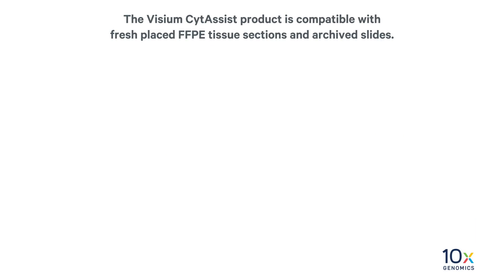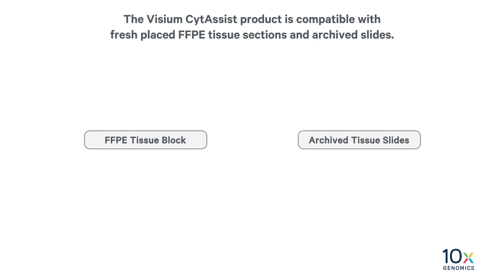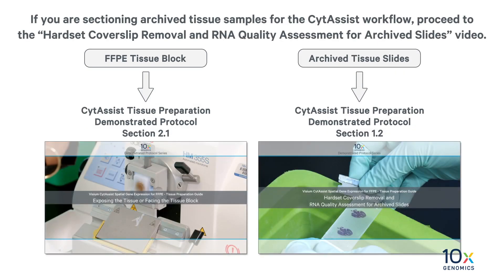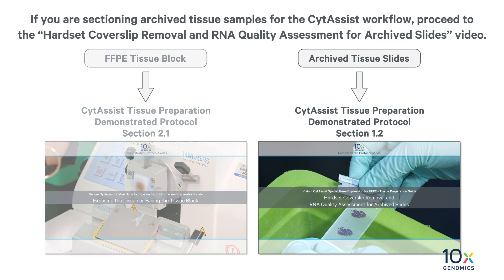We are preparing to section FFPE samples. The Visium CytAssist product is compatible with fresh placed FFPE tissue sections and archived slides. If you are sectioning archived tissue samples for the CytAssist workflow, proceed to the hard set cover slip removal and RNA quality assessment for archived slides video.